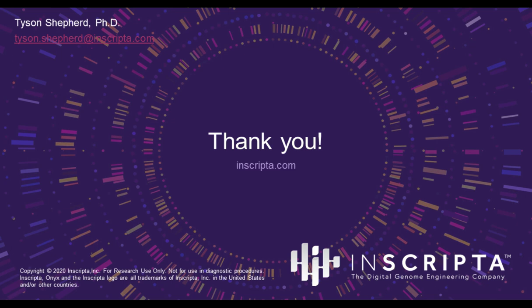That's an excellent question. Thanks for the opportunity to clarify on this. So the barcodes are not something that you'll directly interact with. That's something that's automated and through the design platform itself. Those barcodes are just used for the actual readouts then. The actual instrumentation is not synthesizing the DNA.